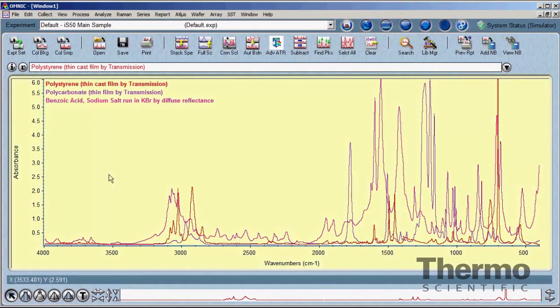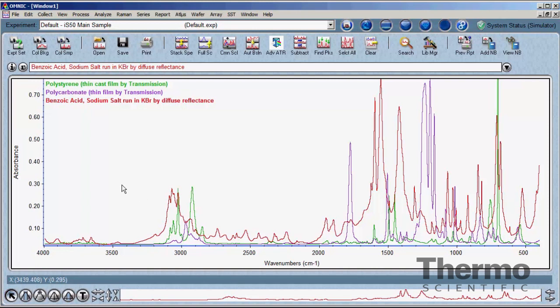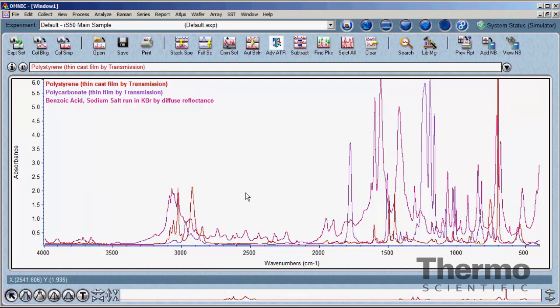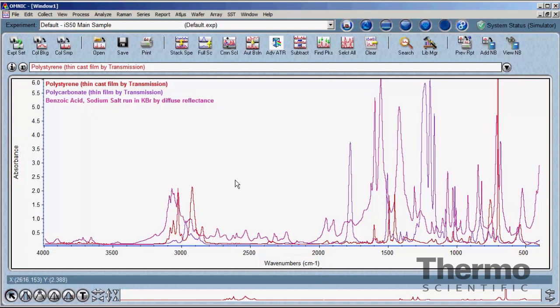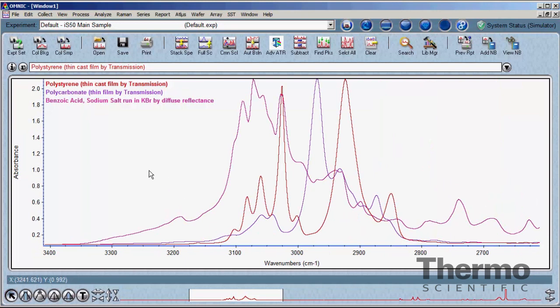The major portion of the display is where the spectral data is shown. Multiple spectra can be displayed here, and each spectrum will be shown in one of eight colors. When a spectrum is selected by clicking on it with a cursor, its color will change to red — this becomes the active spectrum, and the previous active spectrum will return to its default color. The X and Y axes will be labeled for the active spectrum; in this example, the X axis is labeled in wavenumber units and the Y axis in absorbance units. The cursor in default mode can be used to zoom into different portions of the display by dragging a rectangle and clicking in it. Multiple spectra can be selected by clicking on them while holding the Control key, which is required for functions like spectral subtraction.